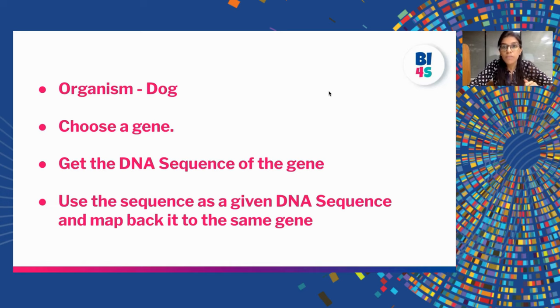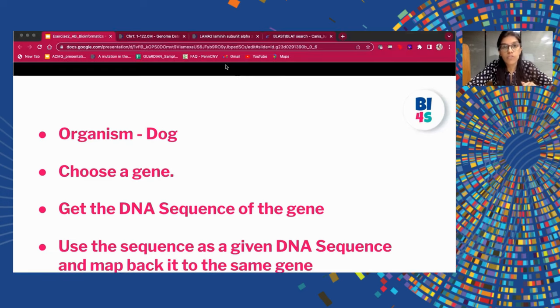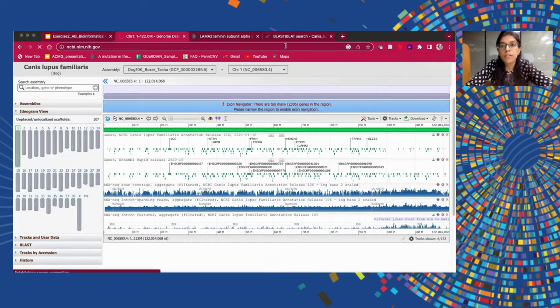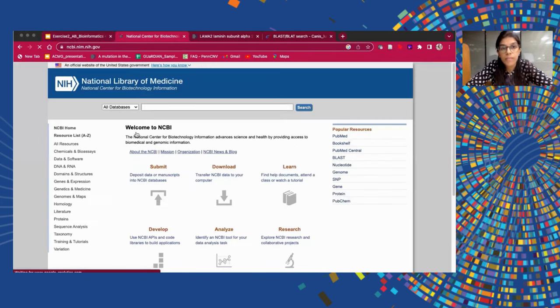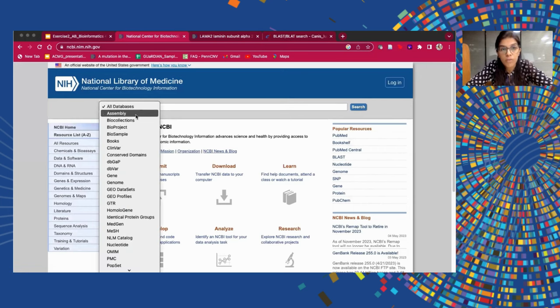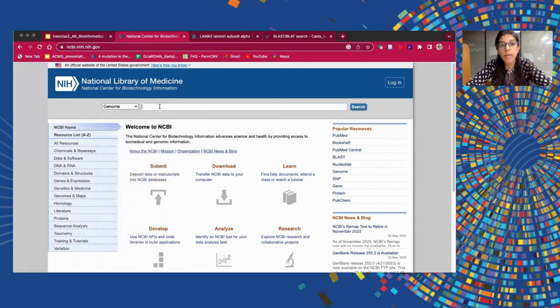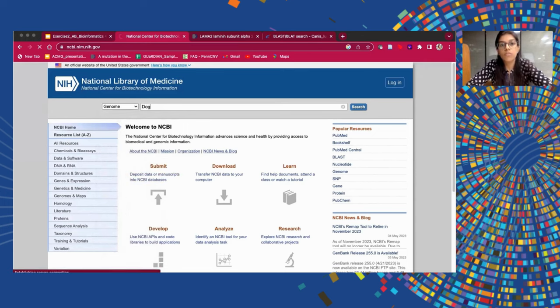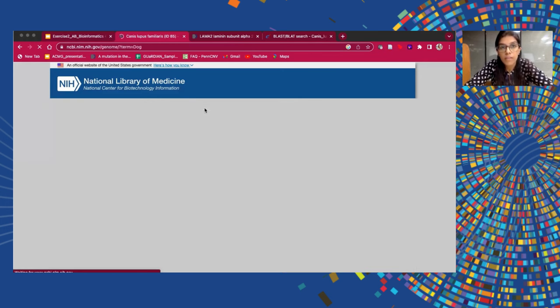We will now start the hands-on session. The first step is to go to the NCBI web browser page and from the drop-down section, we have to select genome and press enter, write in your organism's name which is dog, and press enter.